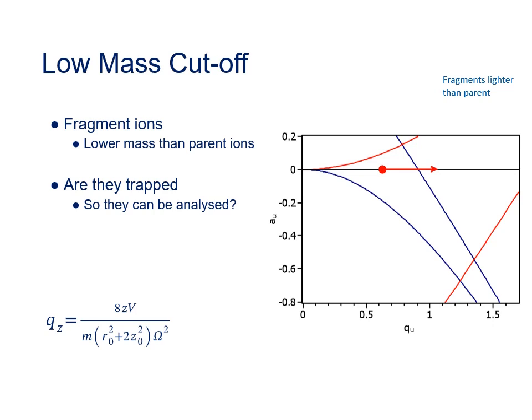Now, fragmentation in a linear ion trap generally happens when there's no DC offset, so all the ions will be on the Q axis. That means the top edge of the stability boundary is at a Q value of 0.908. If fragmentation produces fragment ions with a mass-to-charge ratio that would give them a Q greater than 0.908, they will not be trapped in the ion trap and you will not be able to see them in the resulting mass spectrum.